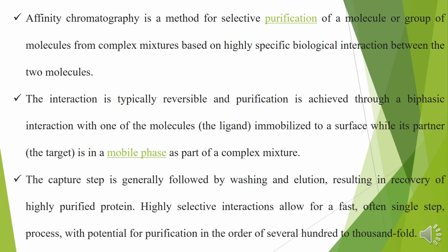In recent decades there have been tremendous advancements in the utility of affinity chromatography, with development of support materials such as flow-through beads, magnetic beads, and monolithic materials, as well as new ligands with a variety of interesting biological properties. In addition, this approach is no longer used only for purification of specific biomolecules. It is also quickly becoming a method of choice to study biological interactions, and can be used for the preparation of samples for mass spectrometry or for specific removal of contaminants.